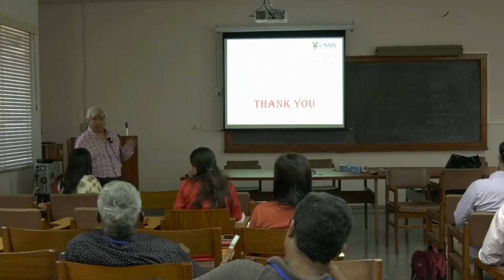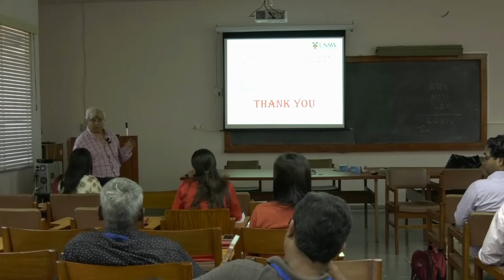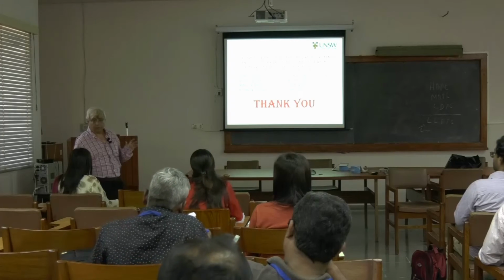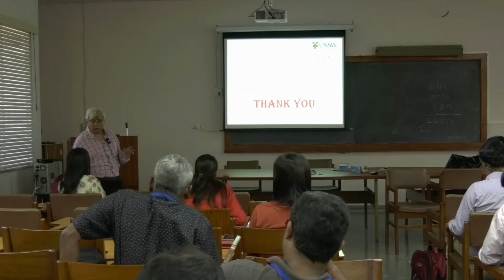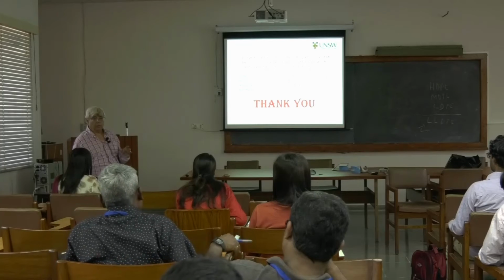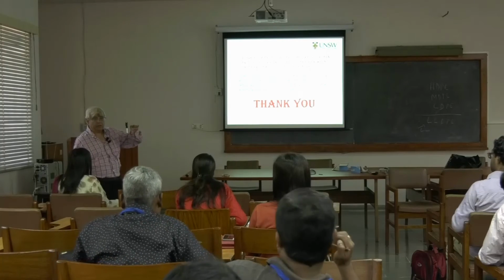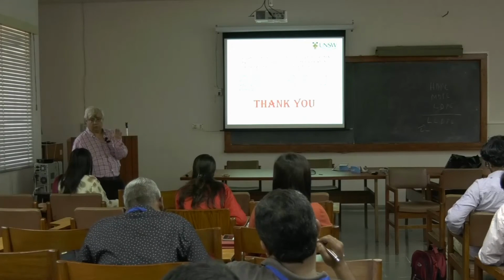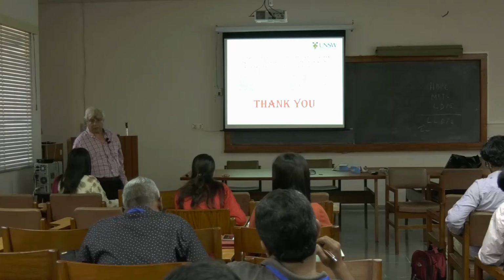But the same studies are all studied under the same voltage. The details are given in the published journal paper. So if you write to me, I can send you the journal paper. Okay, but when we are doing this EDS and SIMS and things like that, it's always under the same voltage. Do not change any of those external parameters.